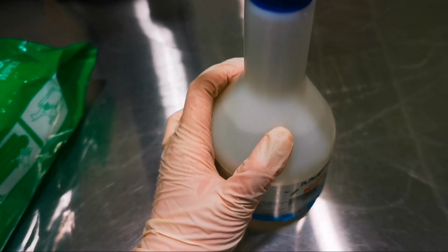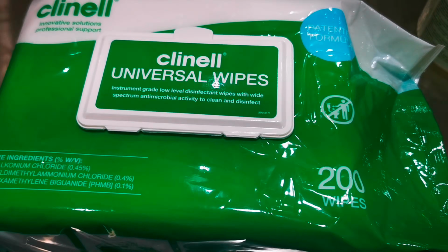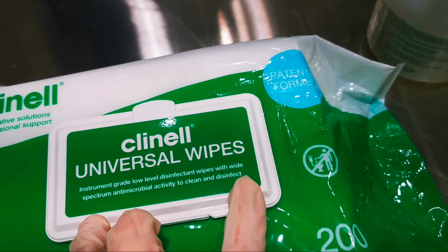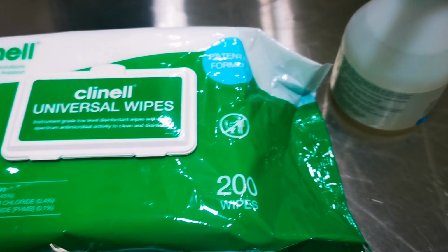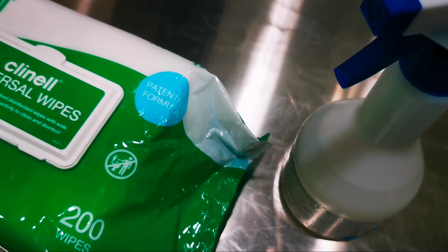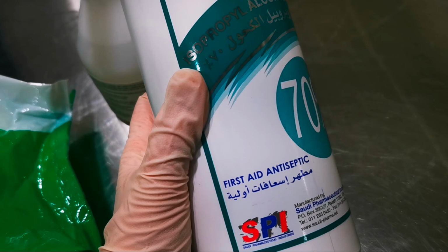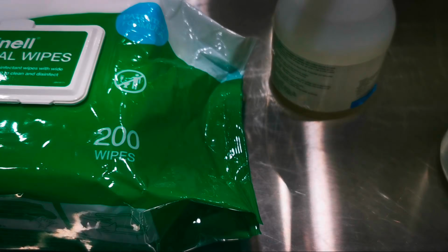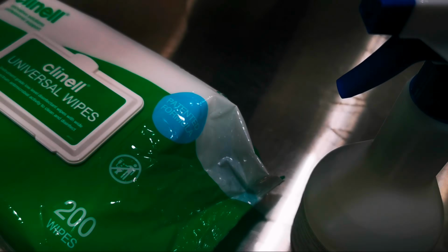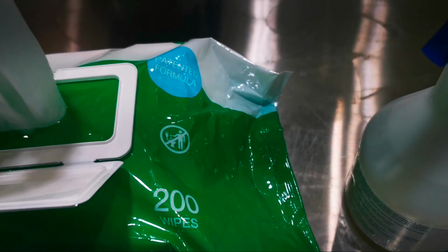Here I have a liquid disinfectant and then disinfectant wipes. So I decided to use the disinfectant wipes. And also I have here an alcohol, but I will not use it because I know that alcohol is for living things and the countertop is not a living thing. So just clean the countertop.